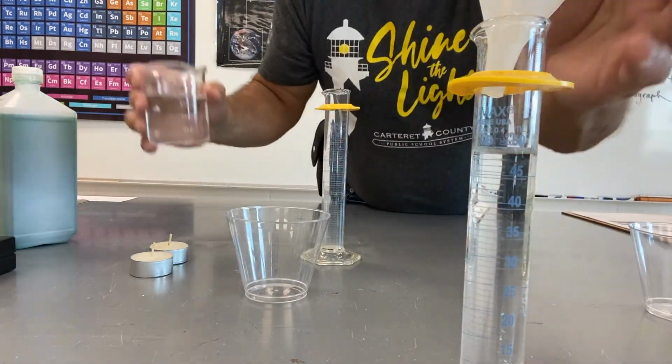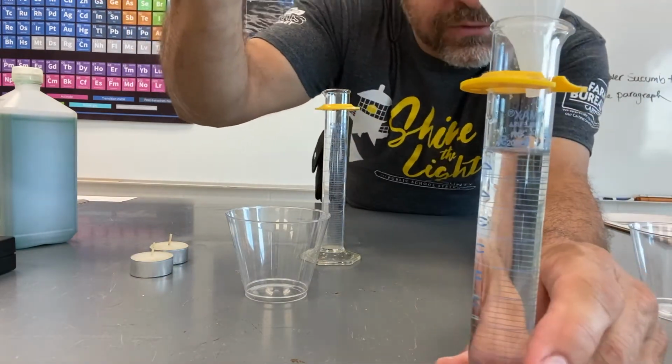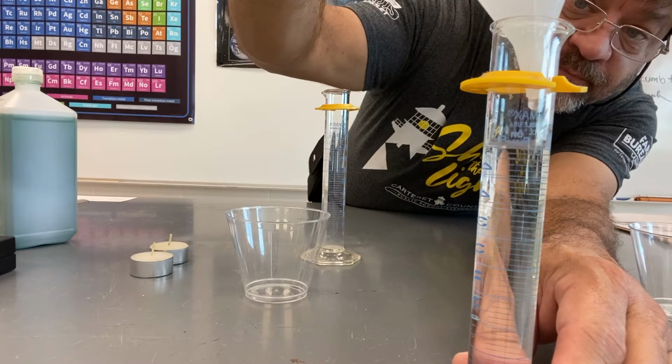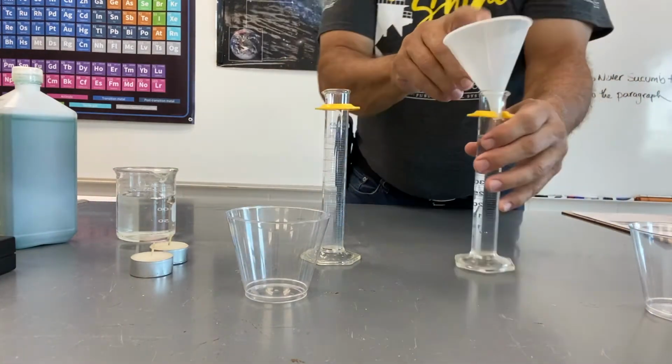So I'm going to go just another drop here. Turn it to face me so I can see the meniscus. And way too much. That didn't work. I should have left it alone.